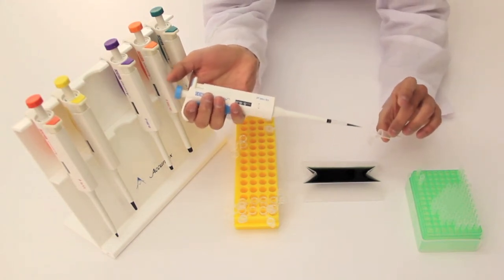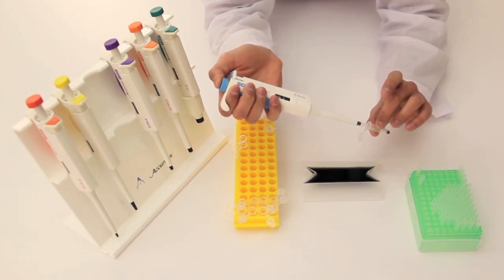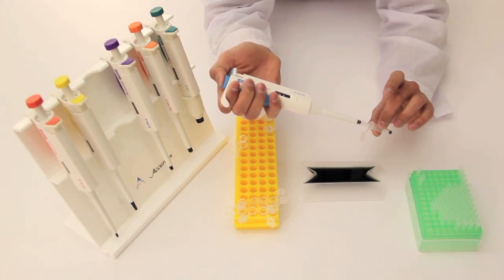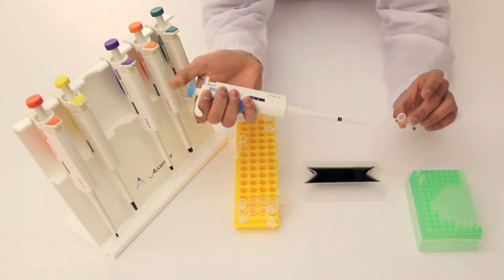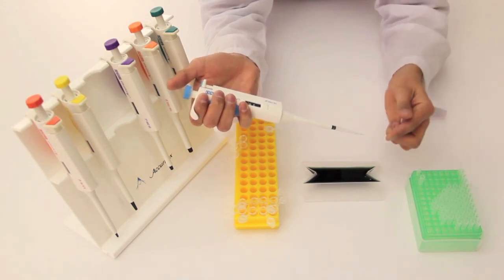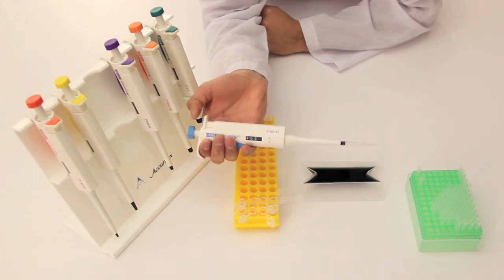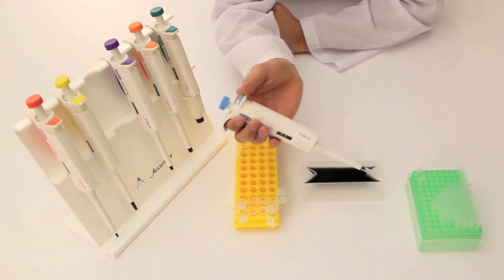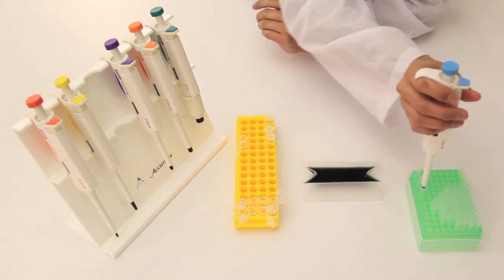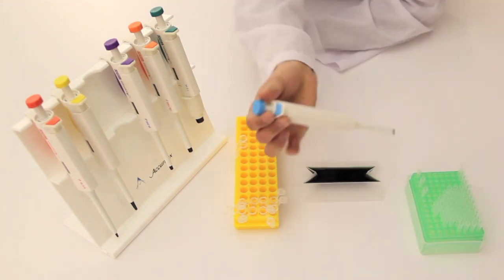What you want to do is insert the tip to the bottom of the tube, press the knob down to the first stop, and then to the last stop to release all the liquid. From there, you can release the knob and secure your test sample. Now to release the pipette tip, all you need to do is press firmly down on the tip ejector, and you're good to go.